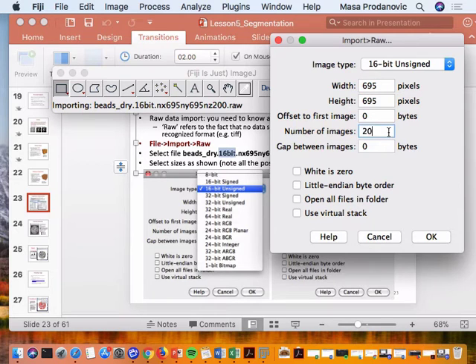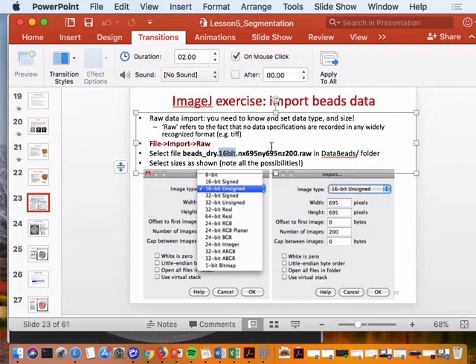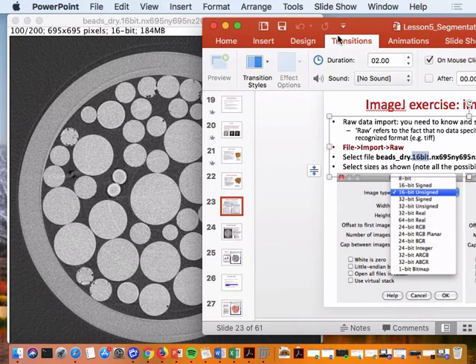So the implication for storing file names: do use file names that have all the possible information you need. What I'm actually missing here is the unsigned part, okay? But given this new functionality of Fiji, you might want to put dimensions first and then 16-bit after that, so it's not going to automatically try to be a smarty pants. Here we go.